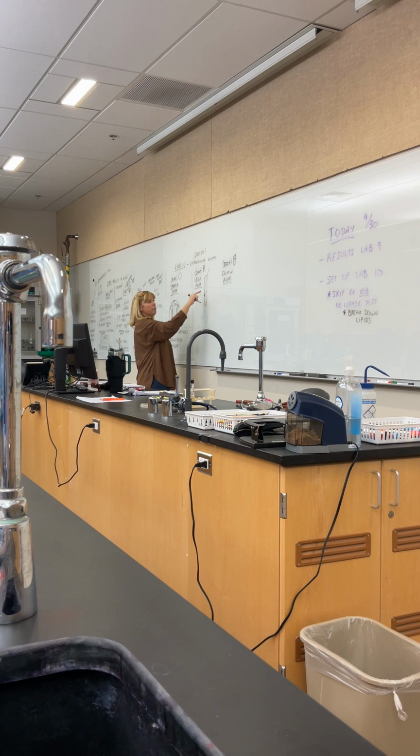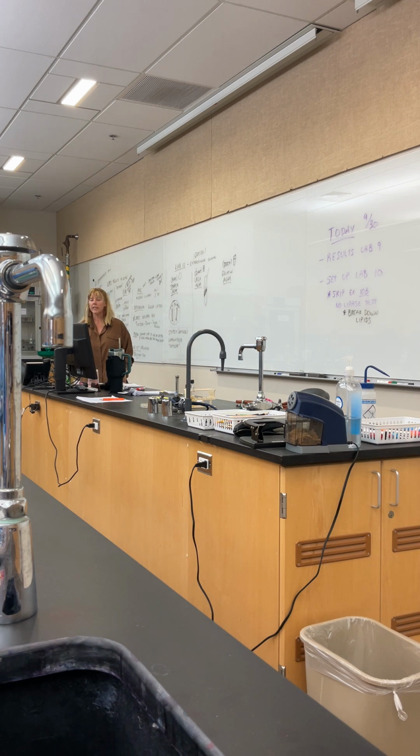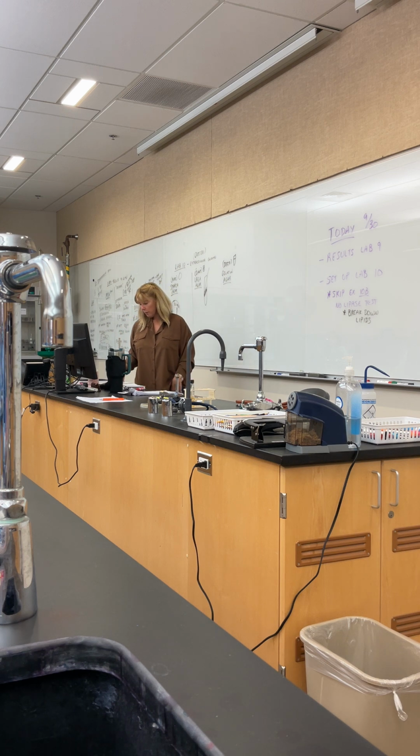We're not sticking into the butt, we're just going to the base of the slant. We're gonna drag upwards, and then we're gonna go back and zigzag, so we get a nice amount of bacteria on our slants. With these slants, we're gonna be setting up our E. coli and I believe our Proteus. Yep, our E. coli and our Proteus.